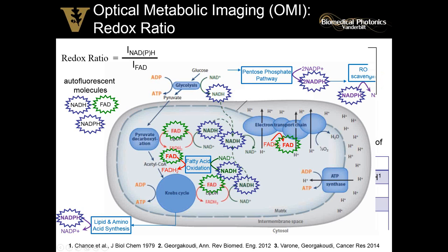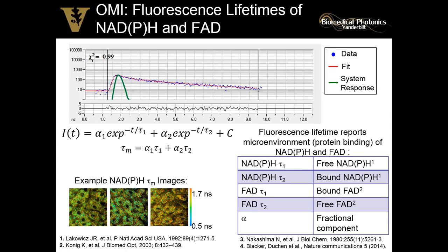So Mohammed already showed this, which is great. You're totally familiar with fluorescence lifetime imaging. I just want to point out special cases for imaging NADH with fluorescence lifetime imaging. We have a two-exponential decay for NADH, and this is due to a quenching of this molecule when it's in its free state. So when it's free, it just self-quenches. It kind of folds onto itself.